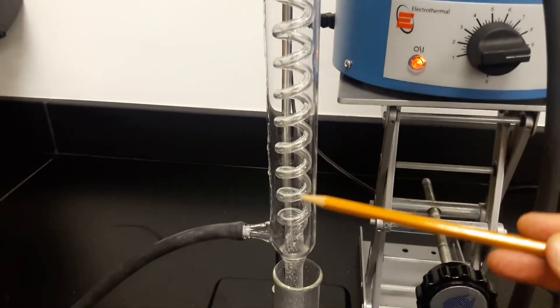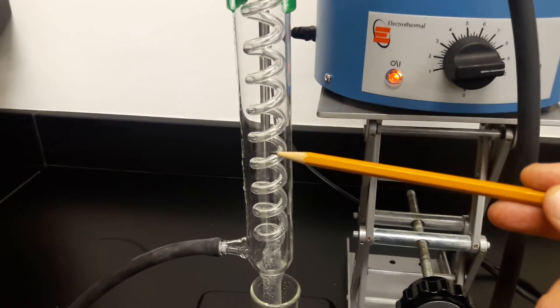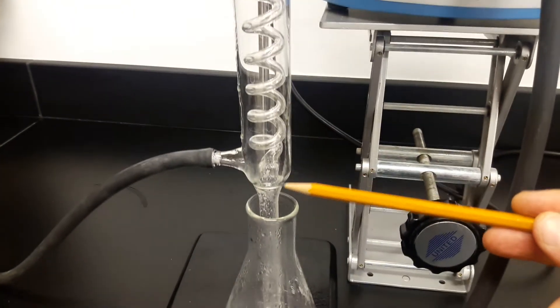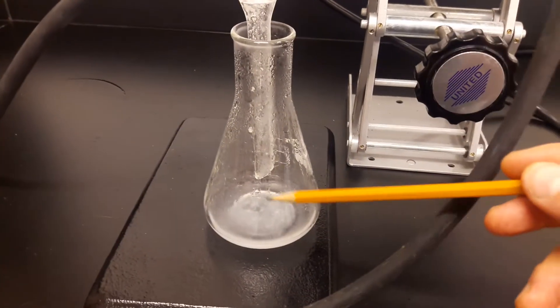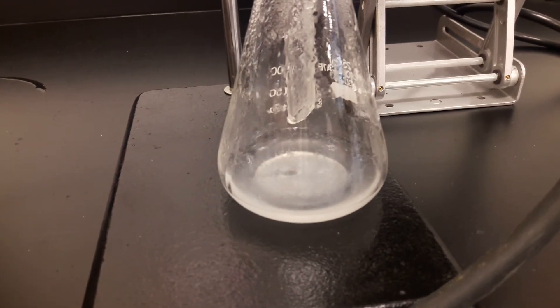The cool water then flows out while the gas that is turned into liquid drips down into this flask. Down here, we've got a flask that's starting to accumulate alcohol.